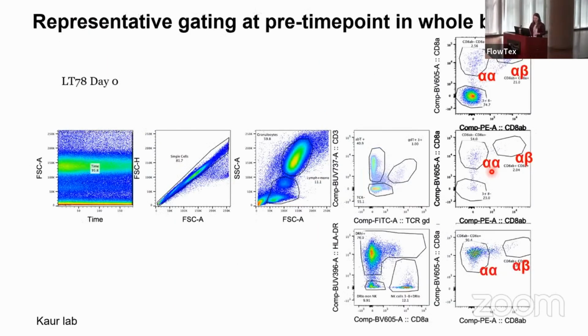This is the gating strategy from our lab: time, singlets, forward and side scatter. Then whether or not the cells express gamma delta, these are assumed to be your gamma delta T cells, and the negative to be your alpha beta T cells, traditional. On the top here, you're looking at the co-stain of the heterodimer or the alpha staining antibody alone. So you're double positive, those are our heterodimer. Majority of alpha beta is heterodimer. Gamma delta T cells, this is similar to humans, are mostly homodimer. The NK cells gated on the bottom really don't see much heterodimer.